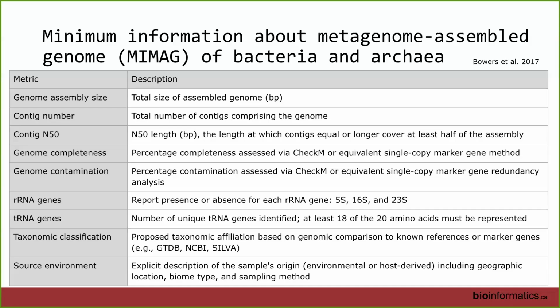Their pipeline is they just use MetaBat2, which is a binner, which you'll hear about today, because for a single binner, it averages better than most. Not in all cases, but in enough cases that they chose to just use one. So there's all kinds of different reasons that choices are made. If you're at scale, maybe you can't ensemble, but we can all do ensemble, and we definitely all should.